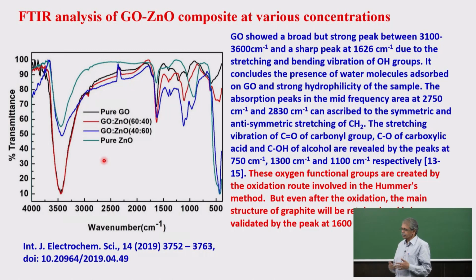Of course, the percentage of these can also be estimated even using the infrared, though that is not part of this particular example. So you can say that the graphene oxide has adsorbed water, and therefore you have good hydrophilicity generated on the surface of the graphene oxide, and that would be required for some purposes which we are not discussing.